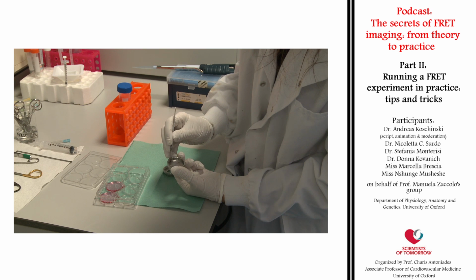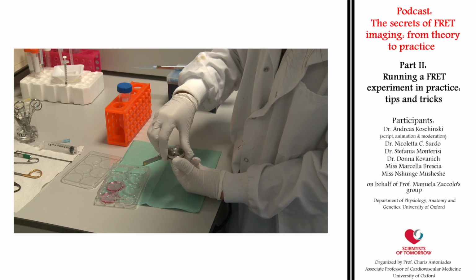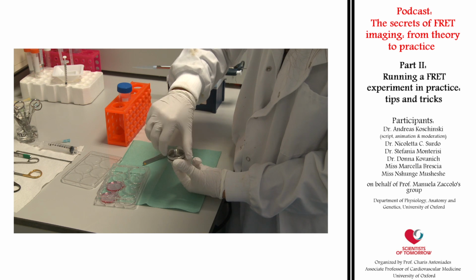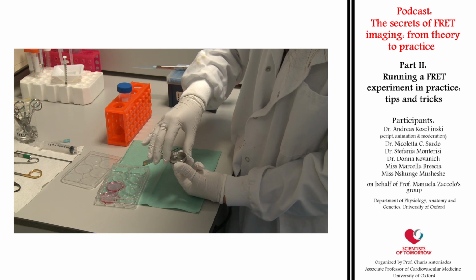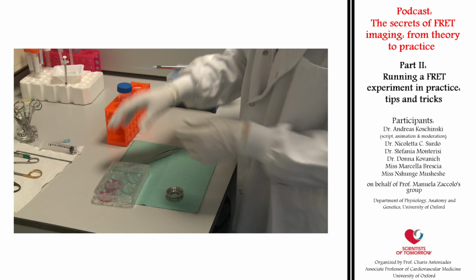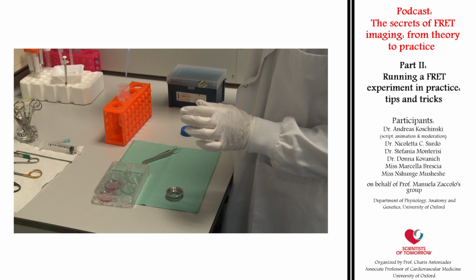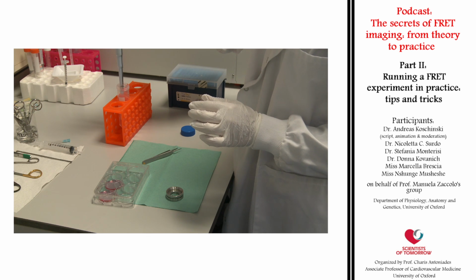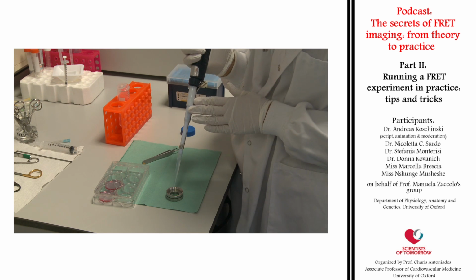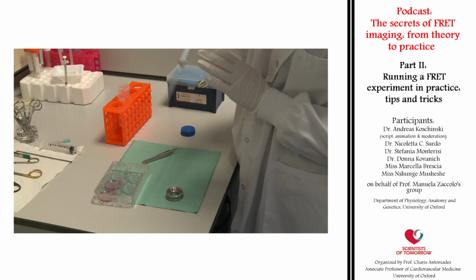For this experiment we use a simple metal chamber which is perfectly fine for many standard experiments. As the cells are kept in a HEPES buffered modified Tyrode solution, many standard experiments can still be done just at ambient conditions. This simplifies the setup. However, if experiments require more physiologic conditions, you will have to use a bicarbonate buffered solution and to apply environmental control. This can be done by using temperature and gas controlled chambers.